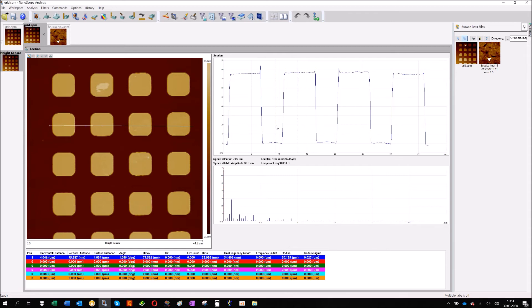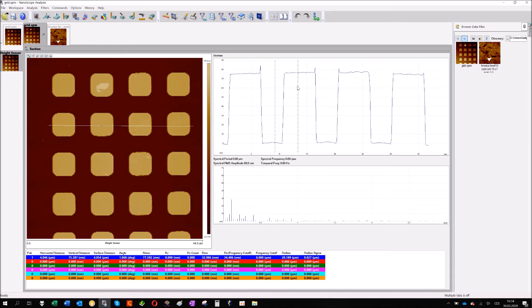Or between the vertical distance. So you can see that's the plateau, that's the plateau. The difference is 75, it should be around 75 nanometers. So it's also okay. Easy way how to get some numbers.